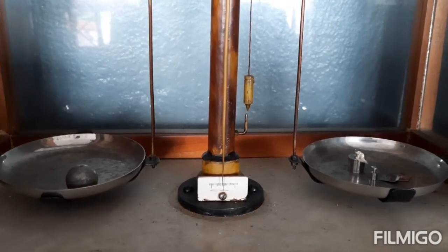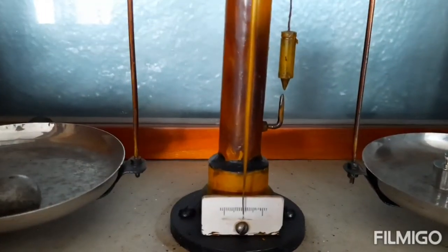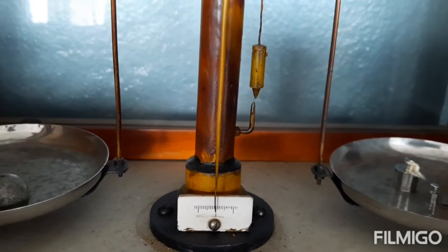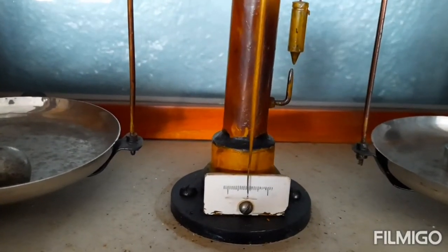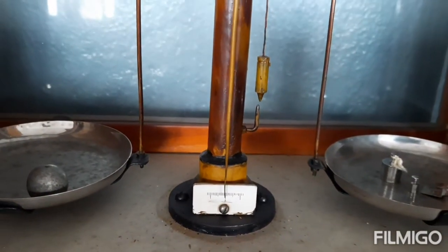With 20 milligrams added, we can see that the bob is balanced. We know it is balanced because the pointer shows the midpoint — we can see it is at the middle, which shows that both pans are balancing each other.